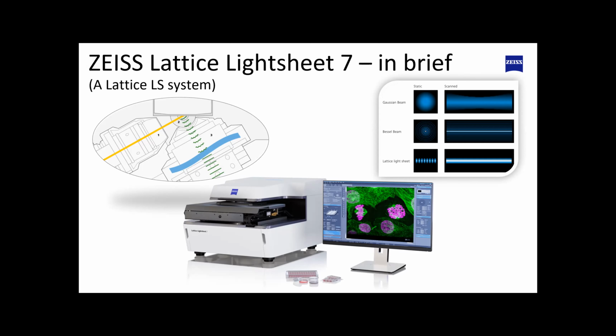So before I go into too many details, actually, I will not go into too many details, because I can't, because of the time constraints, and also I'm not the right person for it. So I just want to mention that the lattice light sheet methodology was pioneered by Eric Betzig, and he has worked very, very hard with Zeiss in the last 10+ years to adapt his original invention into a benchtop microscope that can be used in any lab.